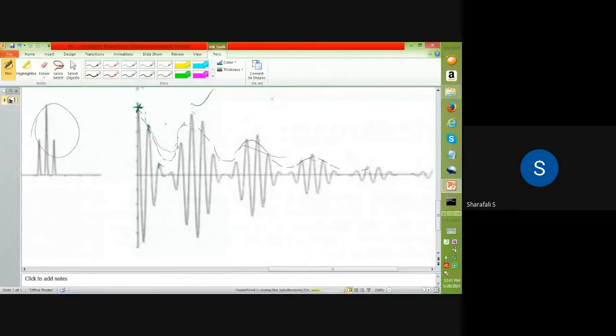That intensity shape will be like cosine, because there is always a maximum at the initial position. All the radiations' interference patterns start with zero path difference, so they all have maximum intensity at the zero position. When there is no path difference, the intensity is maximum for all the radiations. So when you combine all the radiations' interference patterns together, we will get a maximum at the zero position.